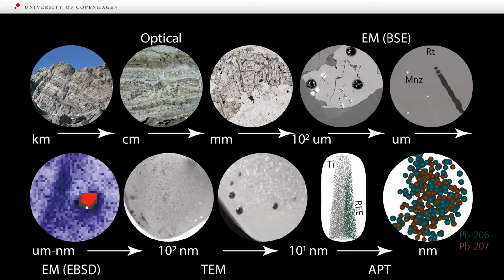So it goes from field images to often electron microscopy, where we can image the individual parts that we're looking for, and then use techniques like EBSD to visualize low angle boundaries, inclusions, use TEM to get specific information, and then get to ultimately Atom Probe Tomography, where we can see the individual ions and, for instance, the composition of a cluster like lead.